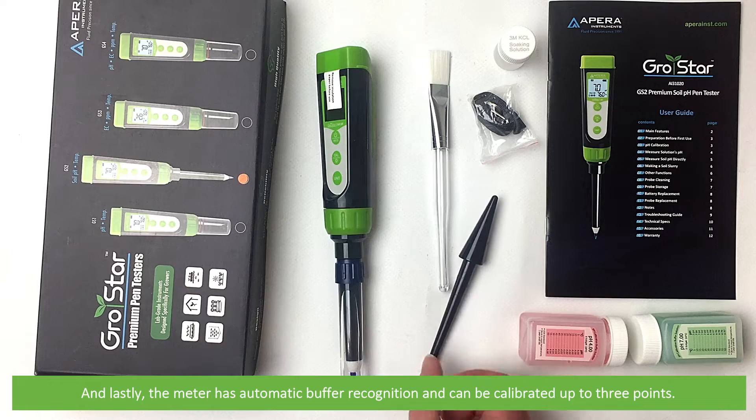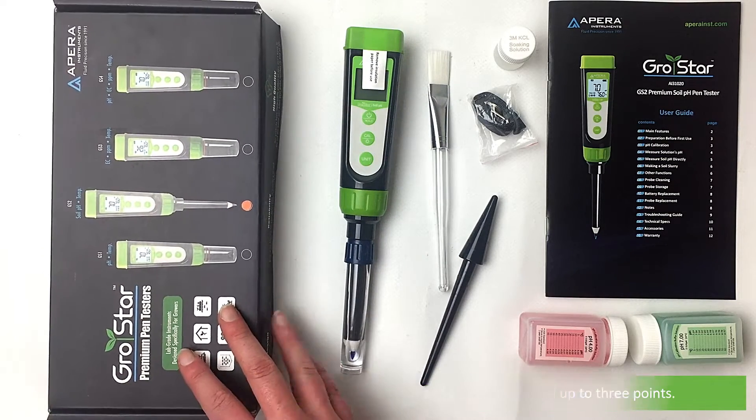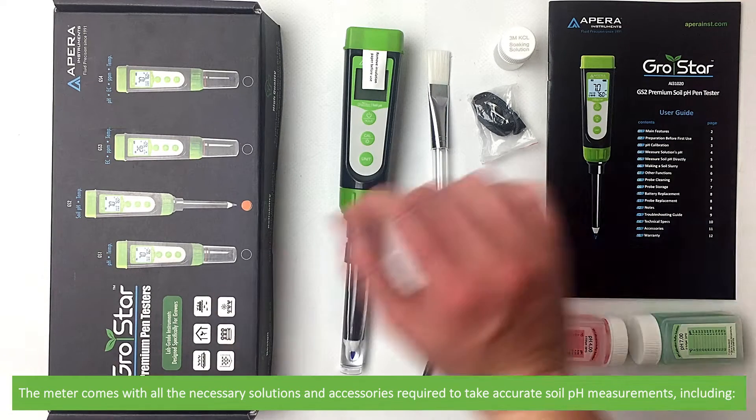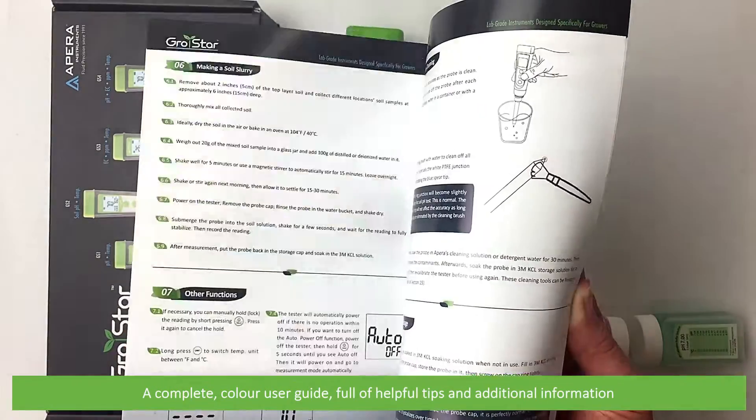The meter has automatic buffer recognition and can be calibrated up to three points. The meter comes with all the necessary solutions and accessories required to take accurate soil pH measurements, including a complete color user guide full of helpful tips and additional information.